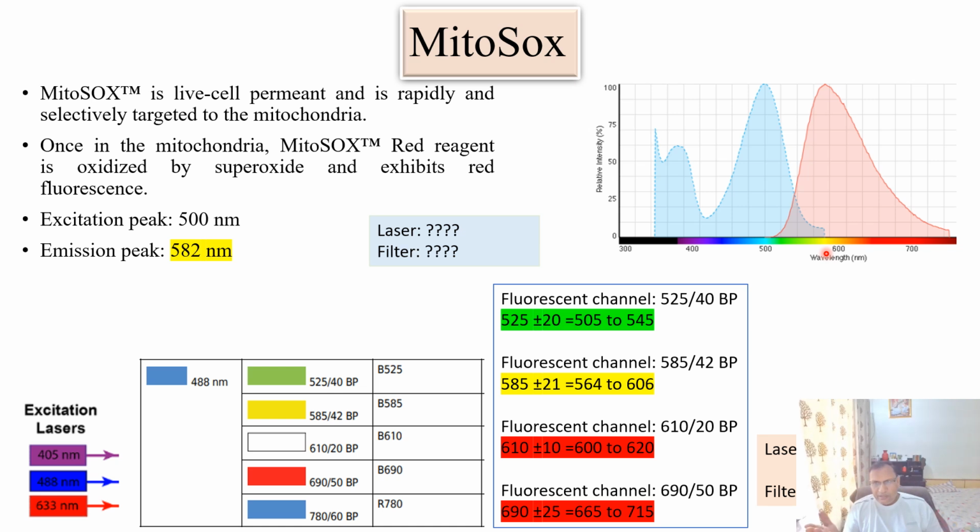After the excitation, it will come back to the ground state and emit the fluorescence. So this is the concept of the excitation wavelength.